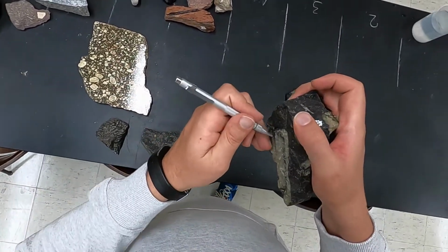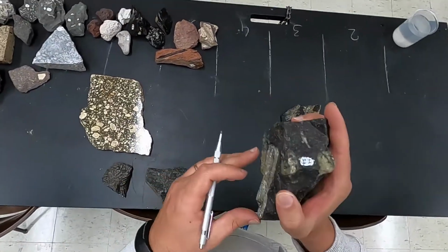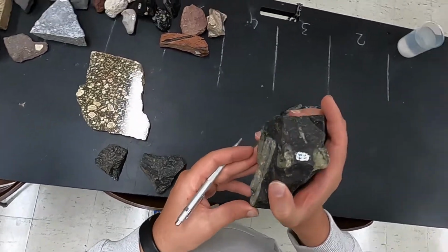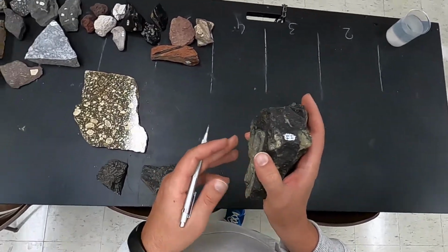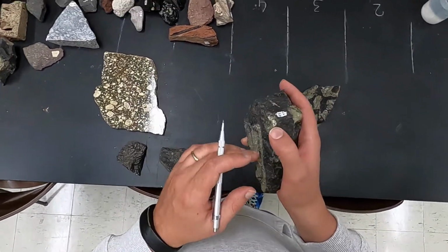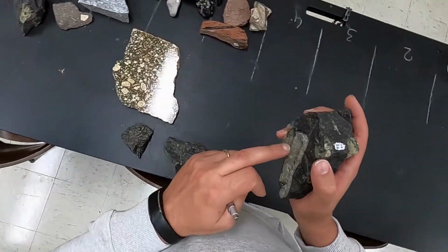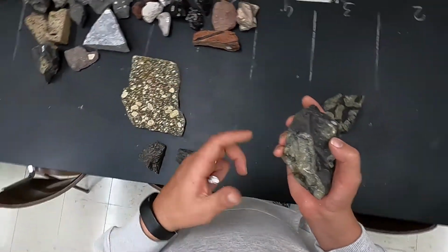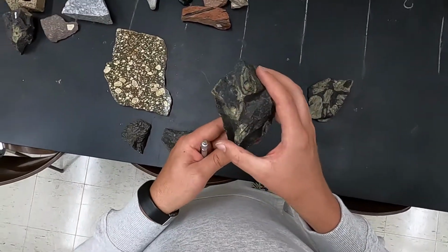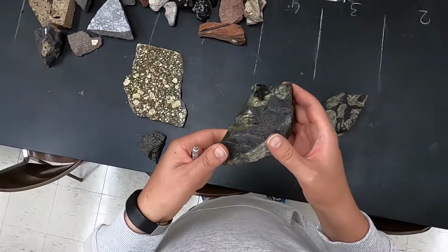In fact, here the color doesn't really change that much, but sometimes like in tourmaline you can see clearly a variation in color, and that's a characteristic of variation in temperature during crystallization, which influences the composition of either the feldspar, or, as I was talking about, tourmaline, a cyclosilicate that forms with those characteristic transitions in color.